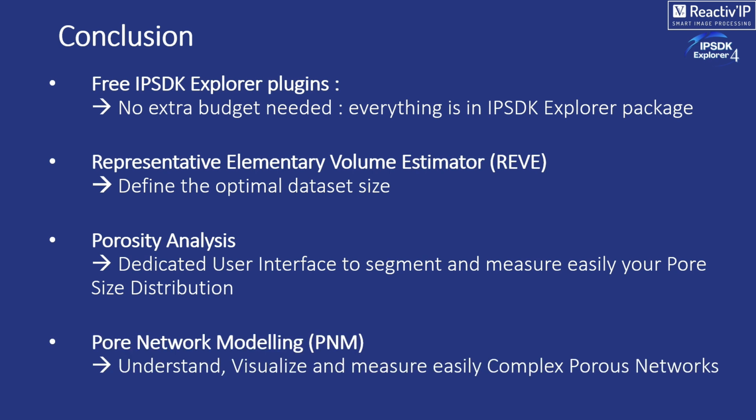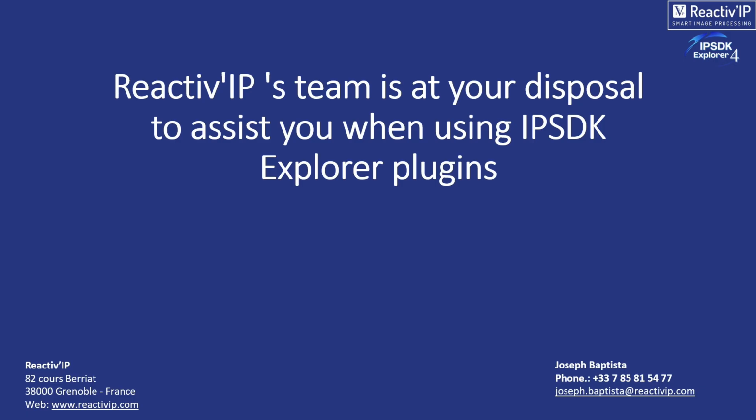If you have, on the other hand, some interconnection between porosities, and you don't want to analyze only porosity per porosity, but really understand how the porosities are interconnected, there is a Pore Network Modelling Plugin, which will permit you to understand, measure, but also to visualize and modelize complex porous networks. And if you still need some help, well, we are here to help you, and we can really share our expertise with you so that you can really focus on your own application.